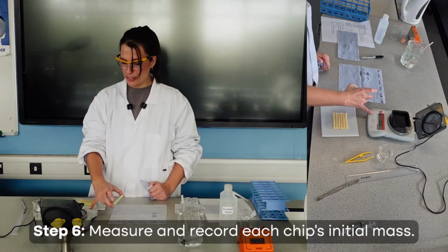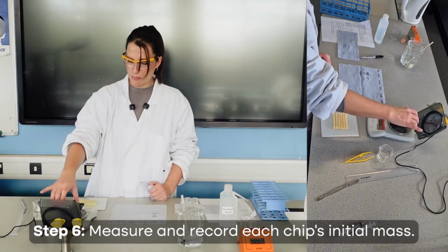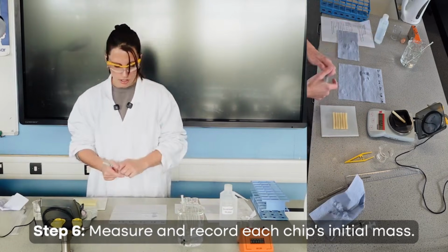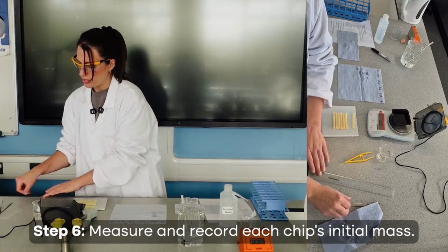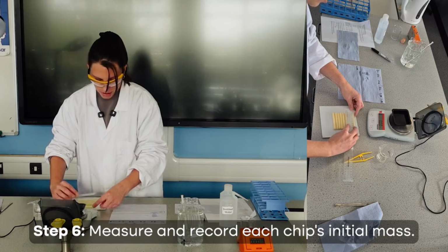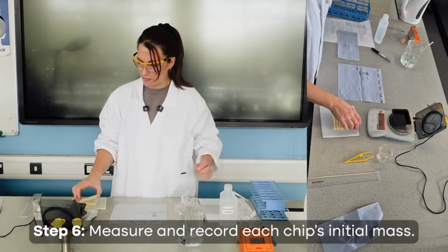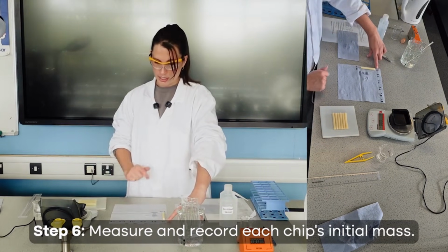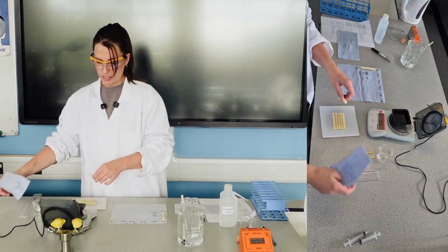So now I'm just going to press the 0 button so it knows that that is 0 mass with that tray on. Place my potato chip that I've blotted in, and I've got 6.02. You could, if you wanted to as well, get students to measure the initial length and final lengths. We could do a percentage change in length and a percentage change in mass. I'm just going to do percentage change in mass for now. And that is the one that I'm going to place in the 0 concentration. So this is how I'm going to be keeping track of it. And then you need to do that for all of your potato chips.